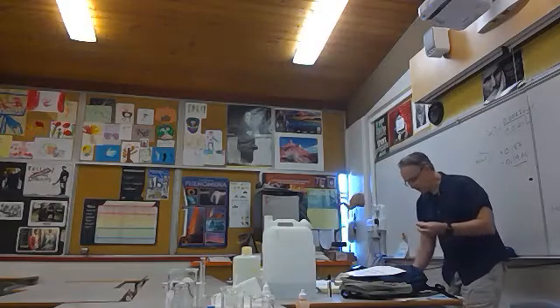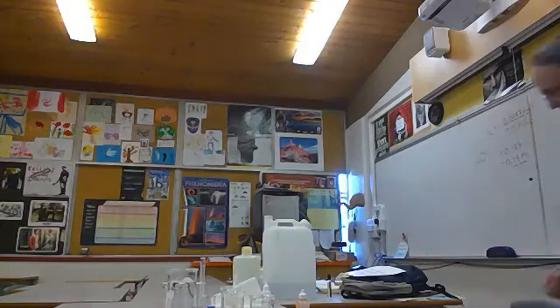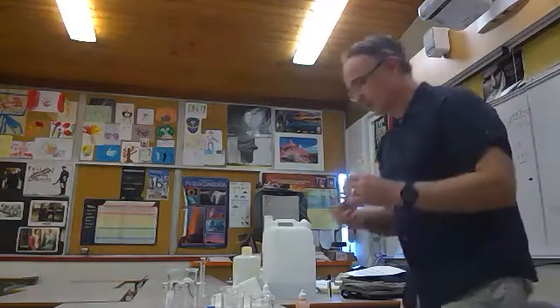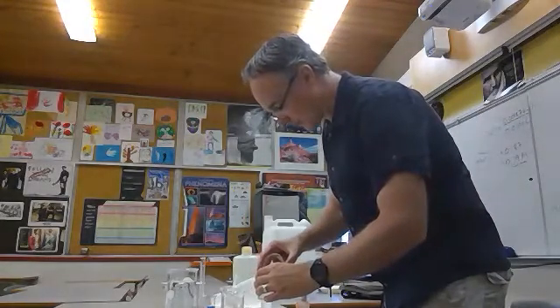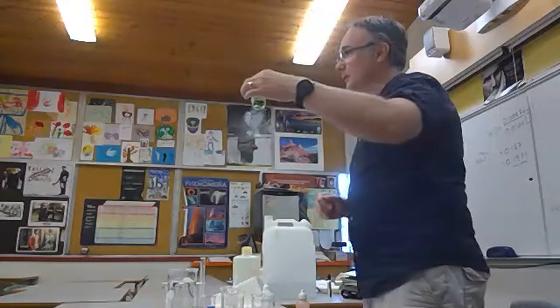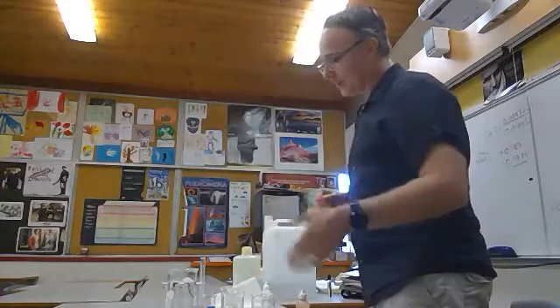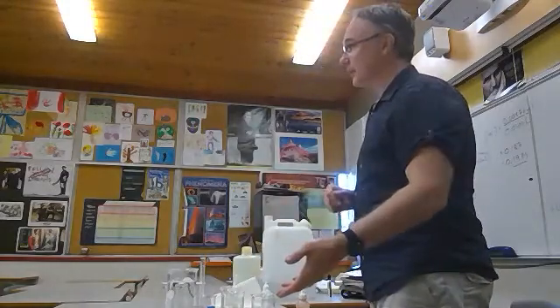Okay, so I just took a pipette and I'm going to use something I usually rather use a straw for, so I can splatter chemical. But remember we said that this green color is pH 7 roughly, right? And if you're in the yellowy, orange, red spectrum, it's more acid.